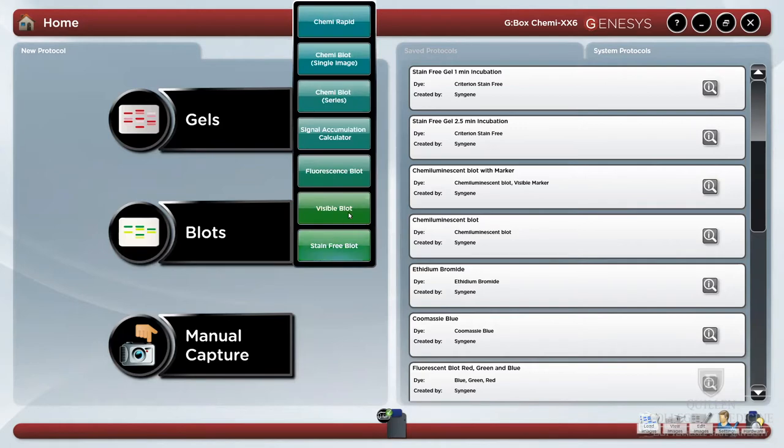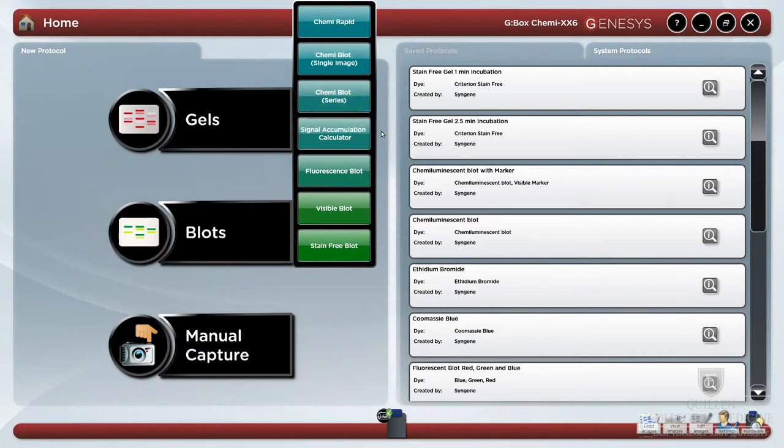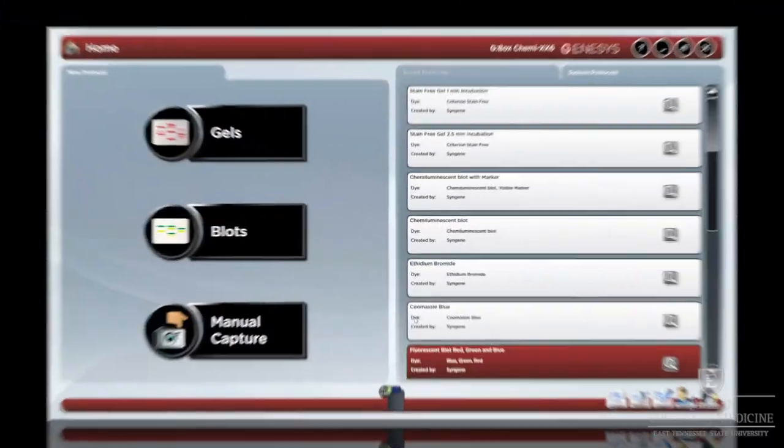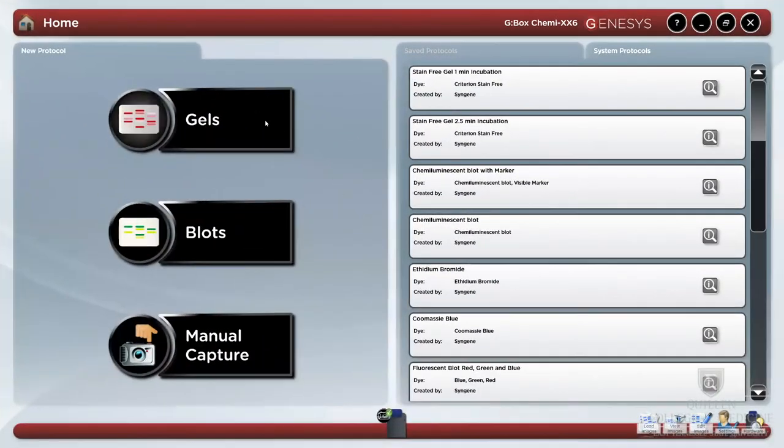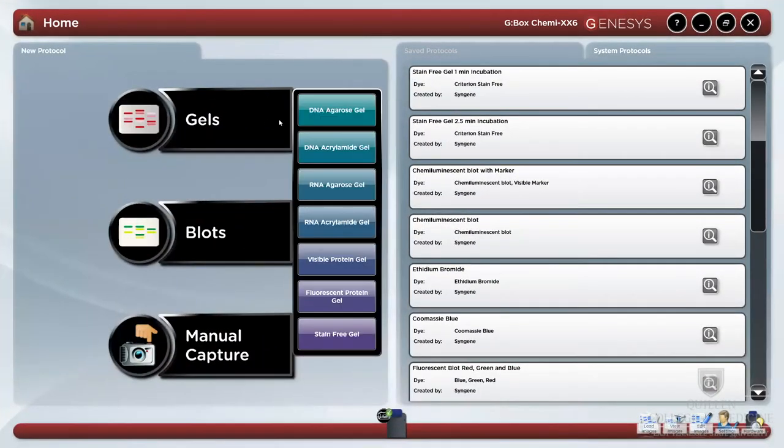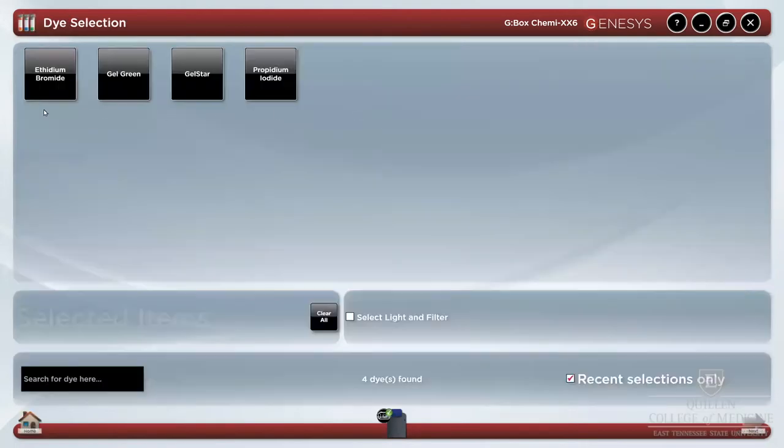For blots, there is a KimiRapid and a manual Kimi blot option, as well as Kimi blot in series with possible signal accumulation calculator, fluorescence blot, visible blots, and stain-free blots. We can delve into any of these menu options to get more details about what are available on our instrument.